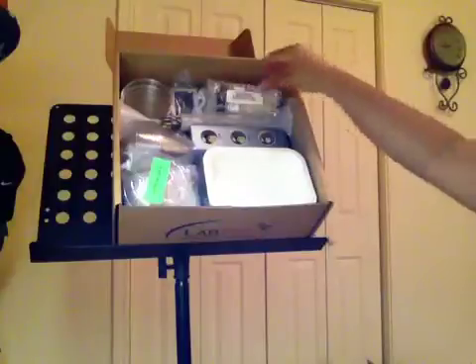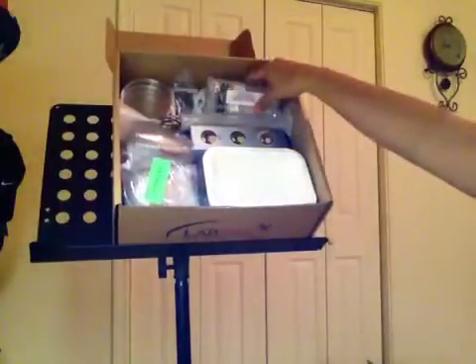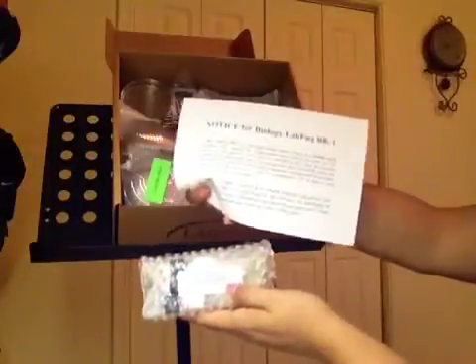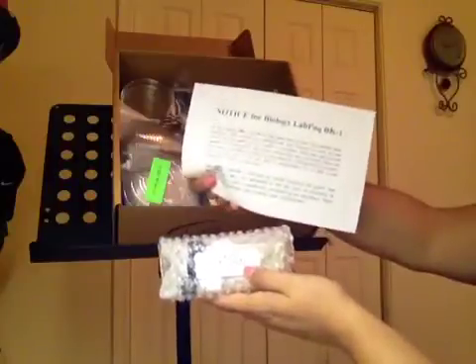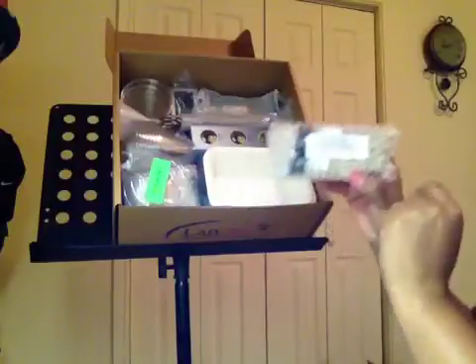Packed right underneath where you lift the dissecting kit, you're going to find, packed in bubble wrap, six glass test tubes. Now these are what this white sheet of paper is talking about — it says notice, there are some test tubes and you need to put them in the refrigerator. Listed on the front it says microbes everywhere, which is the name of the exercise you will use these for. It's important that you follow the instructions to put this in the refrigerator. Do not put it in the freezer — that's not necessary and if you do, you'll actually damage the contents inside.